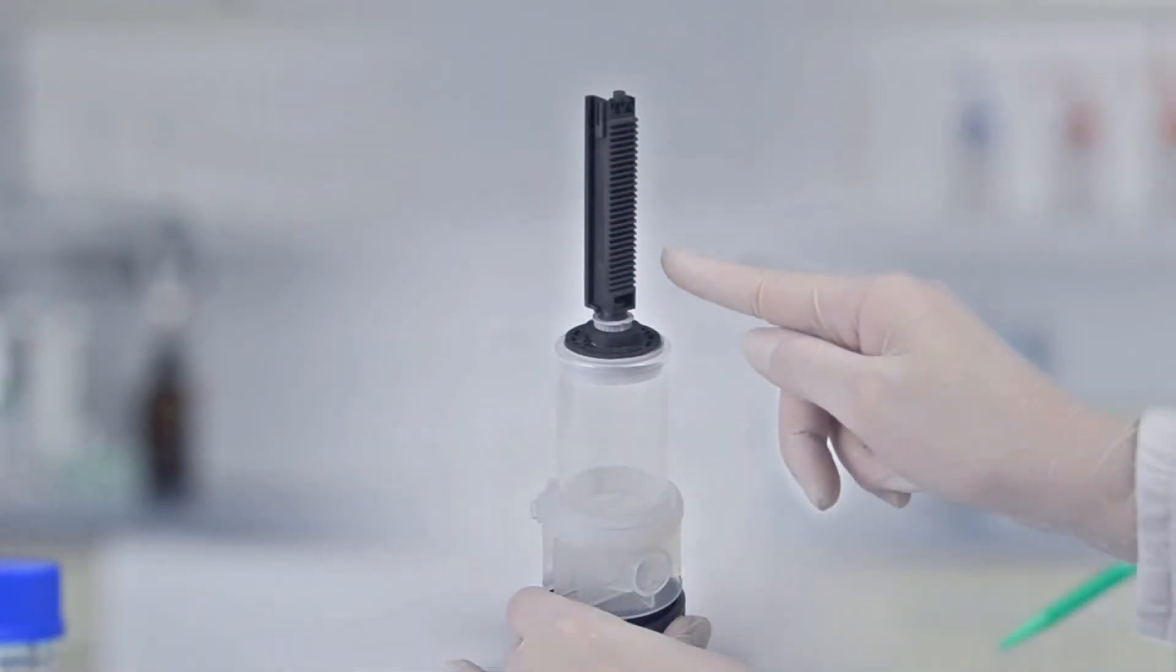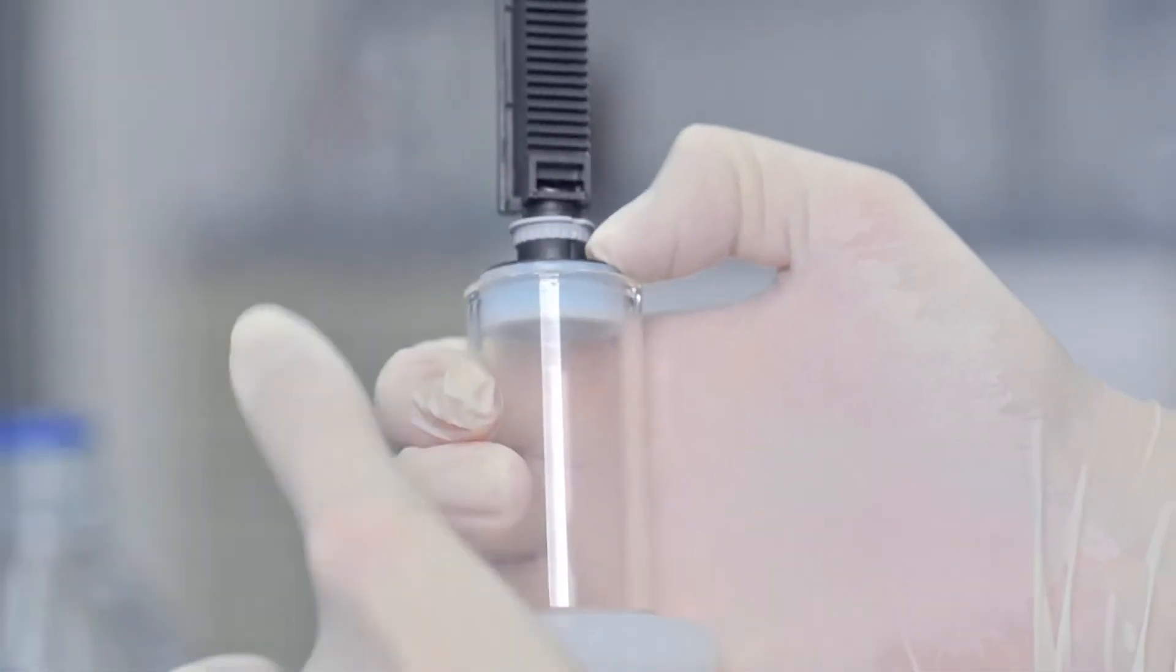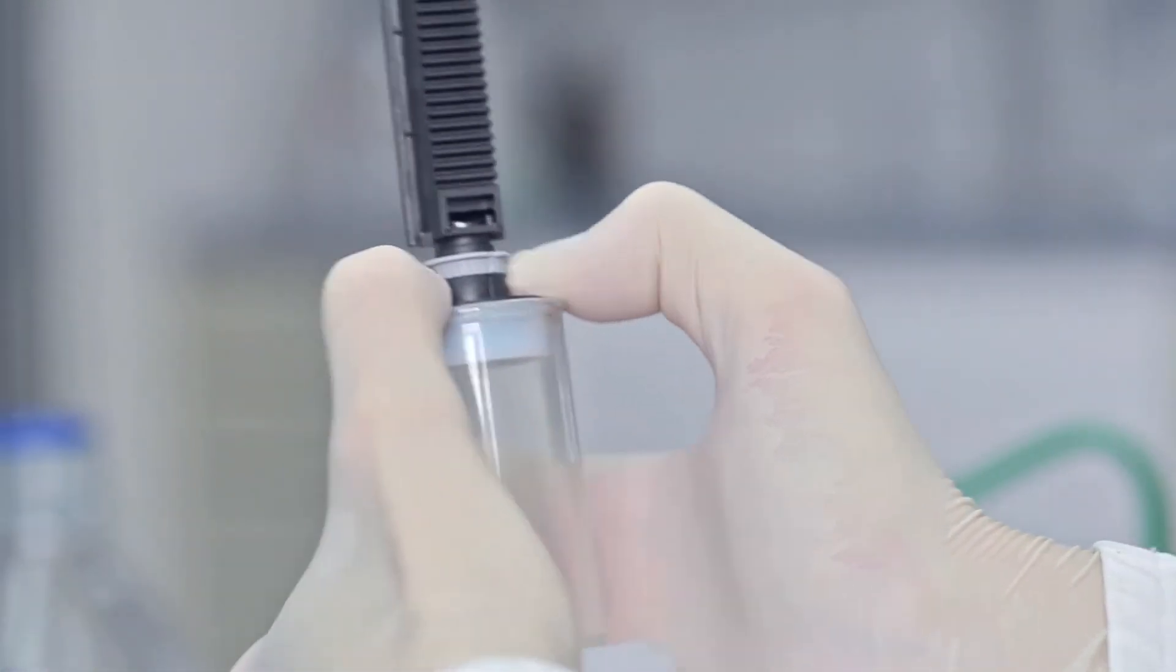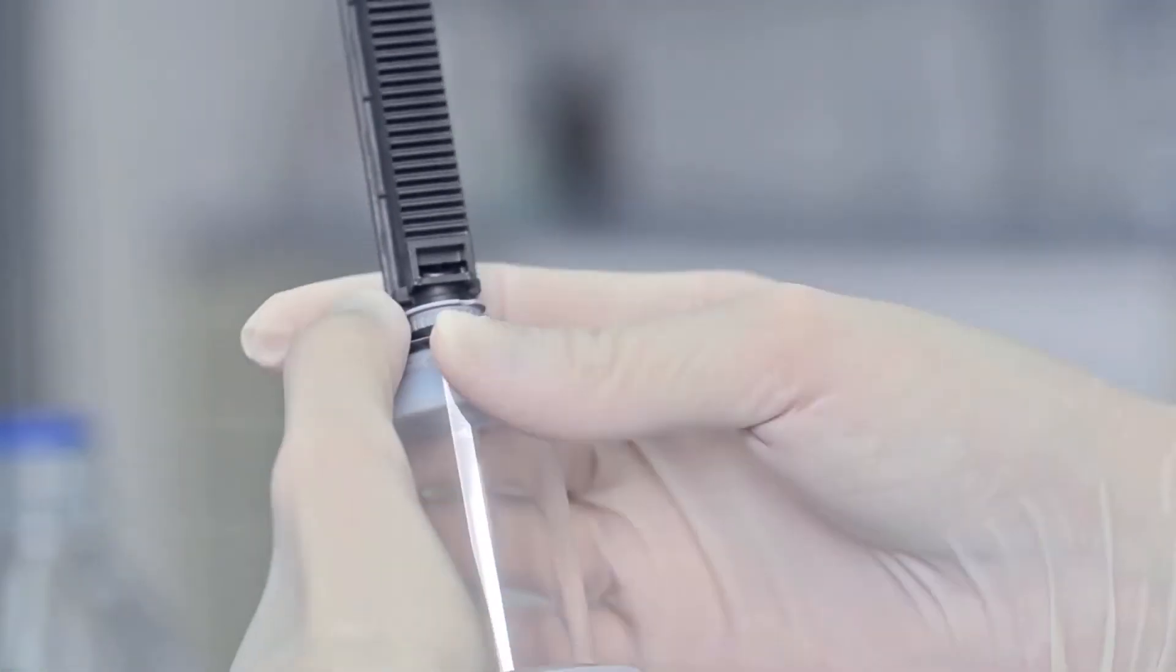Now line up the piston rod. The tooth rack of the piston rod must be arranged in the direction of the air vent opening of the valve block. Now insert the piston vertically into the cylinder and press it halfway in.